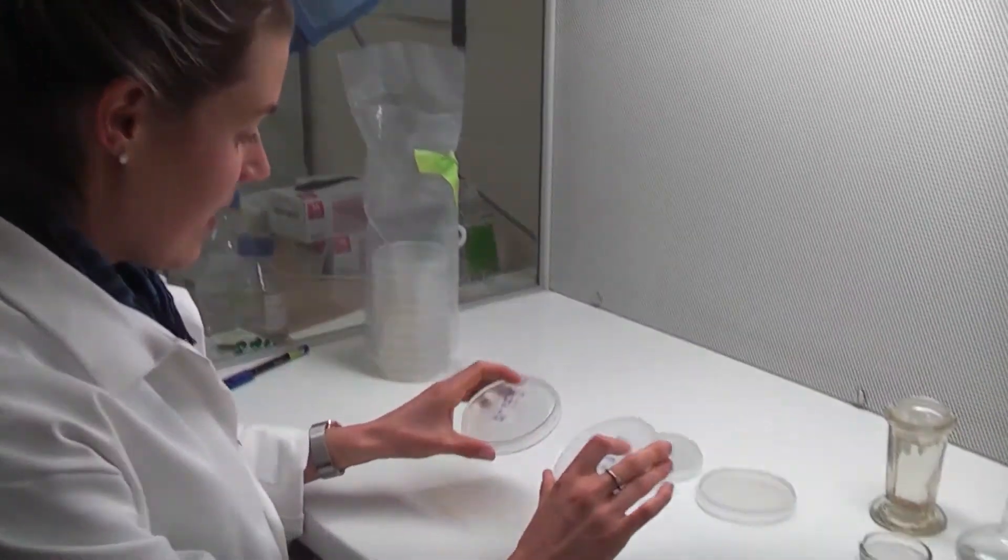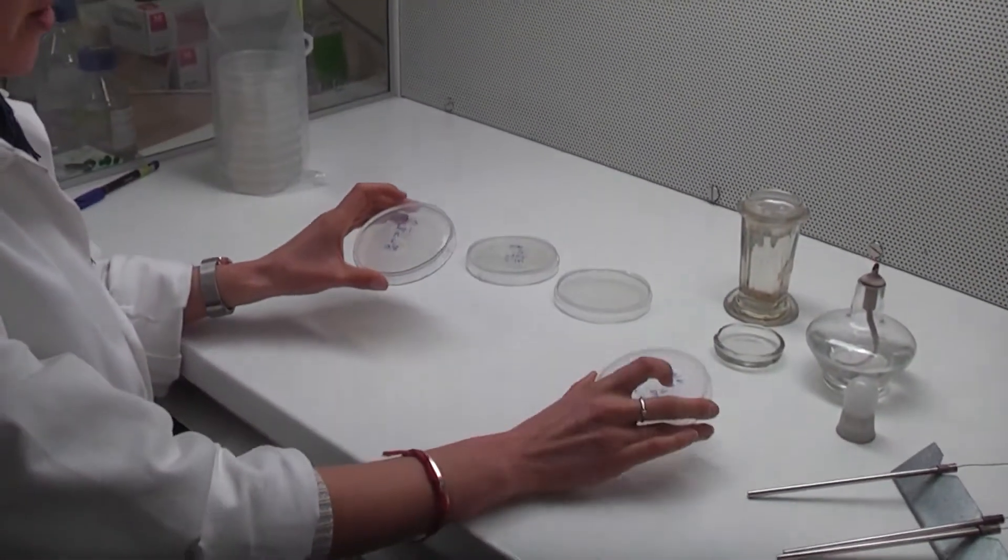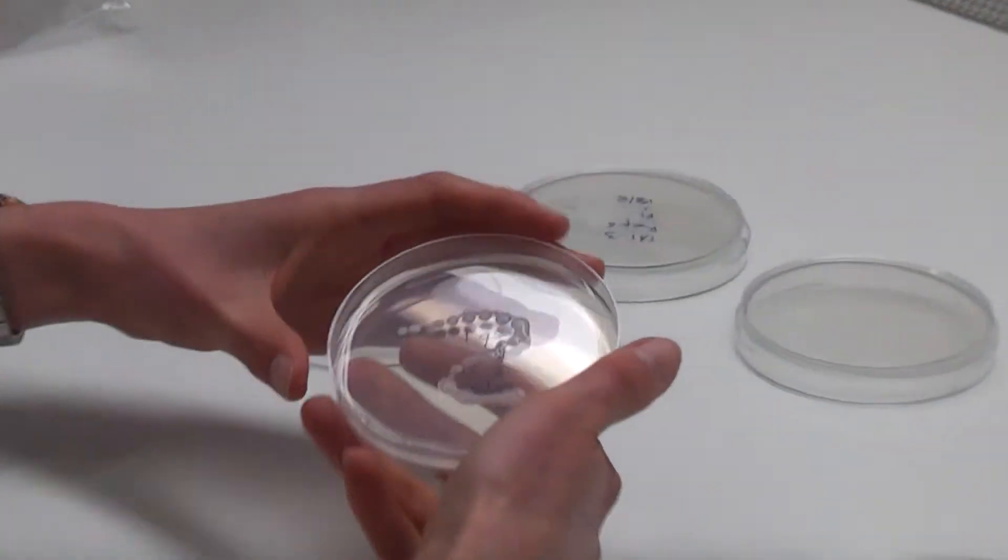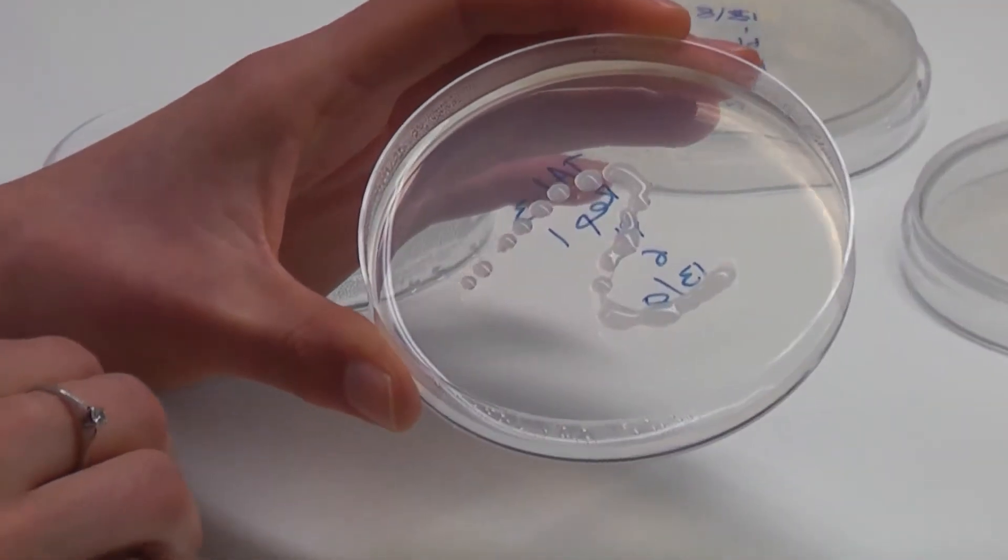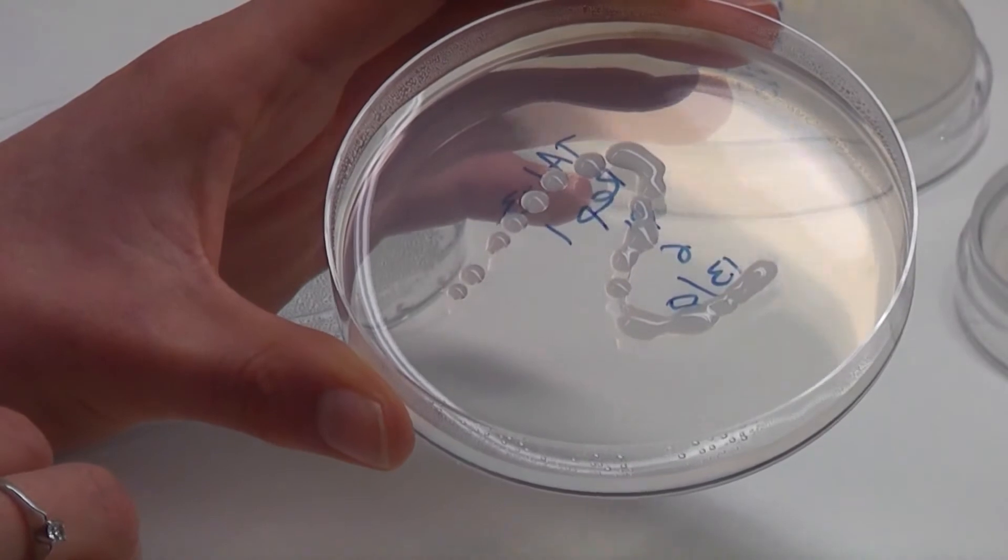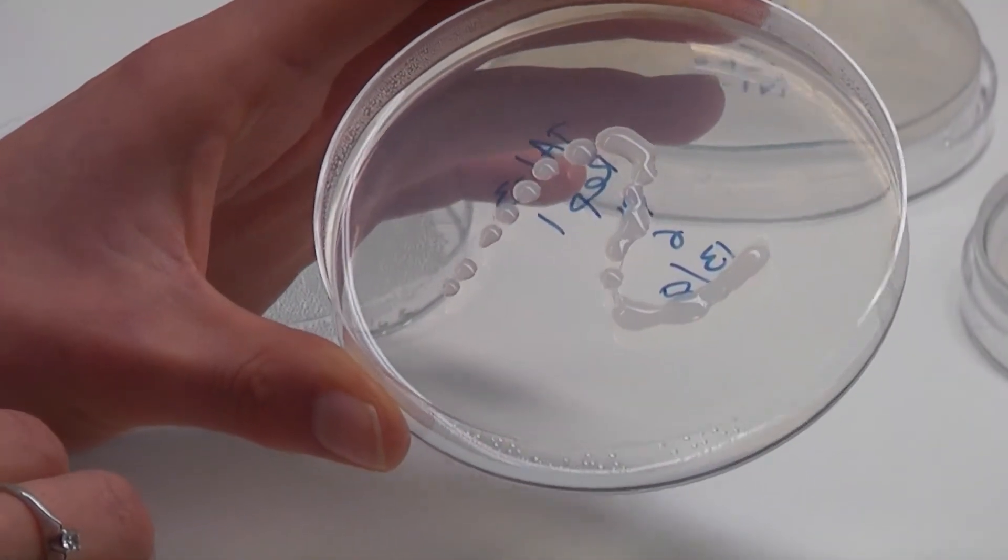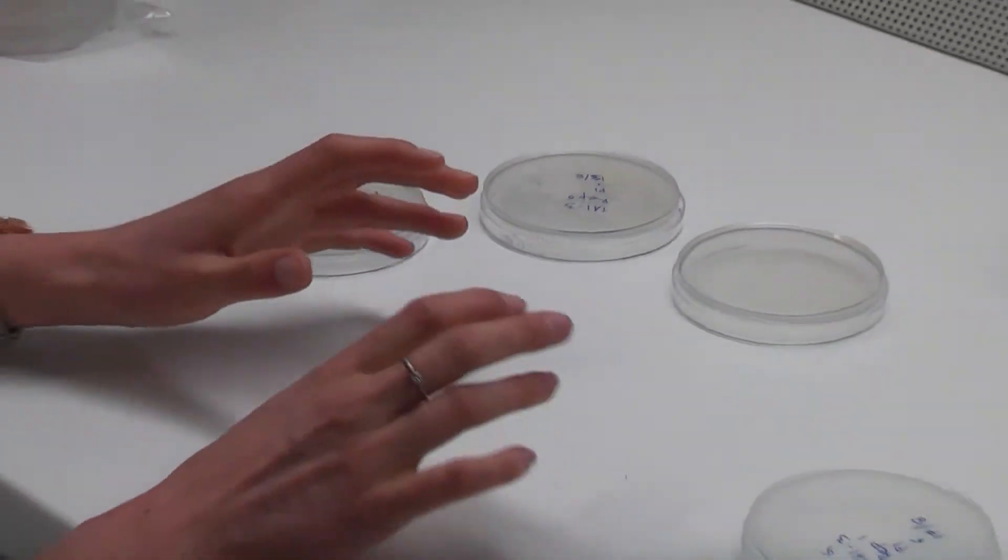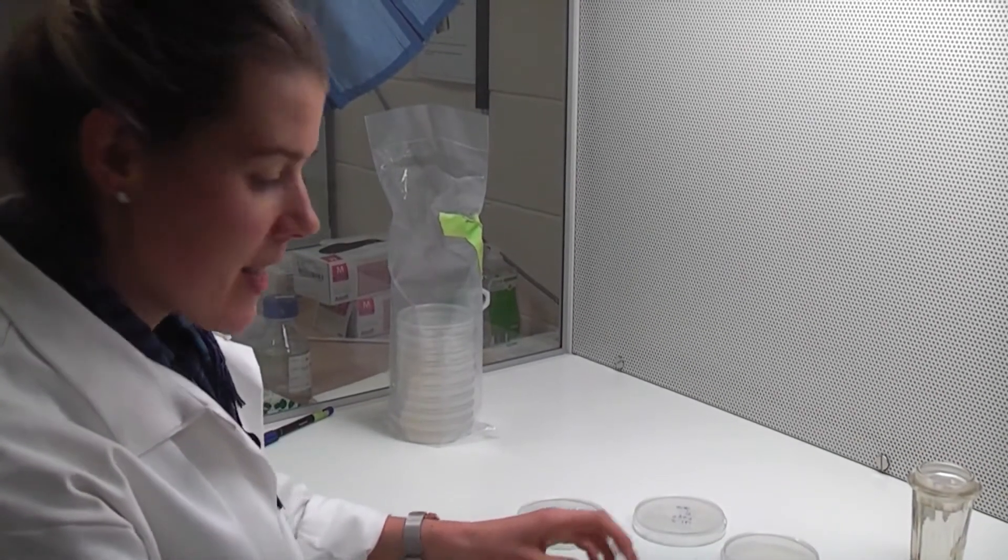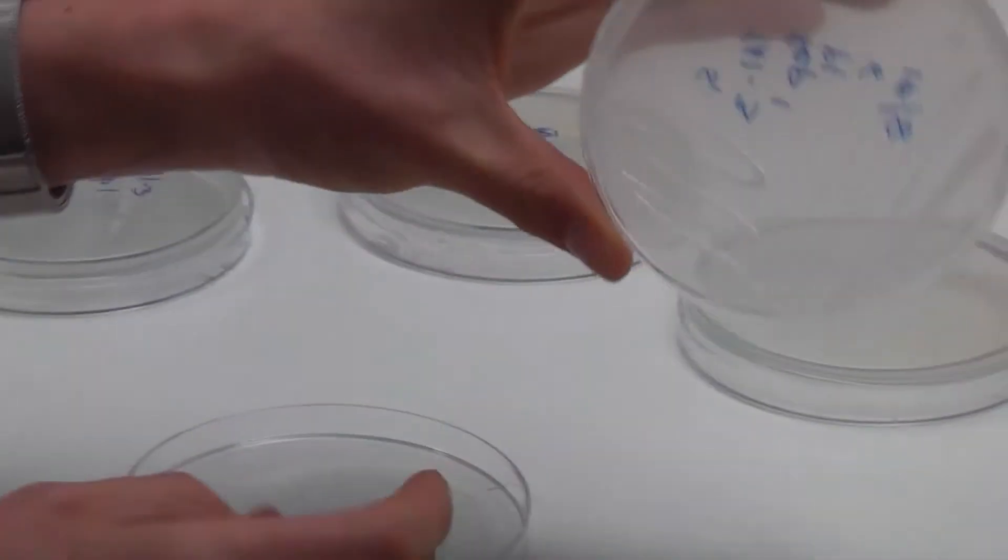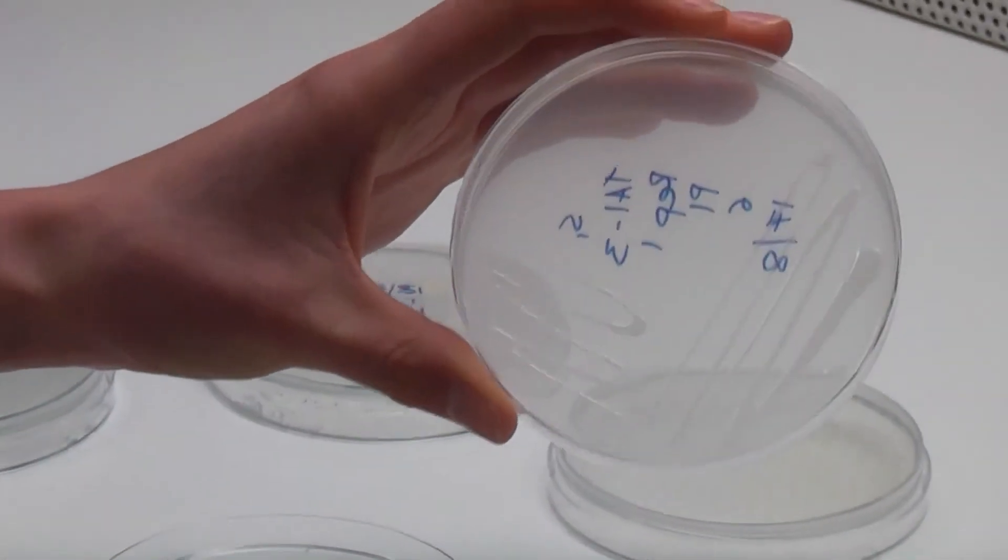So here we have a plate that I'd grown up earlier. This here is the original plate. It's pretty clean but it's just good practice to do at least one sub from all plates. And so you incubate that at 25 degrees in the dark for a couple of days and this is the resulting plate. So that's a pure culture there.